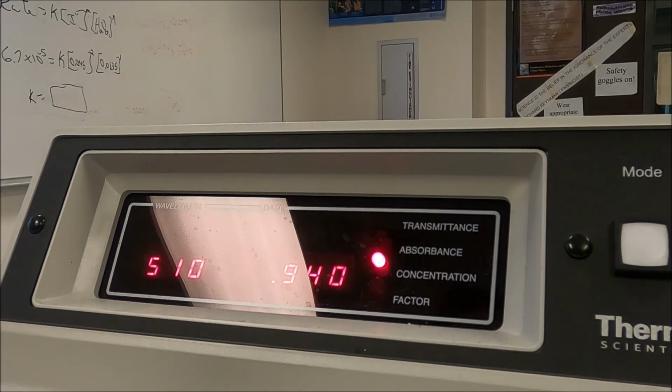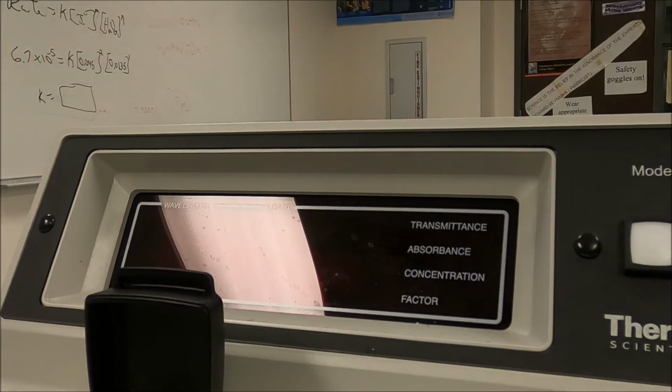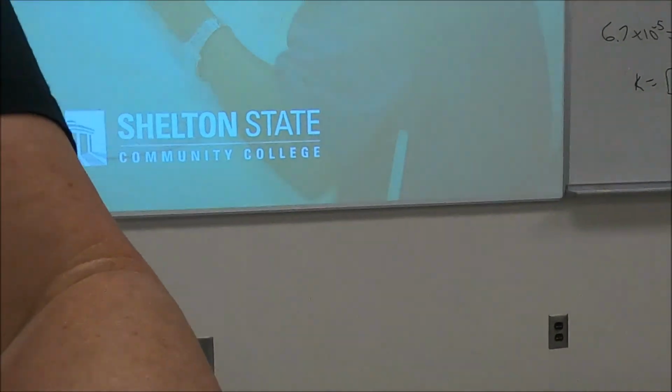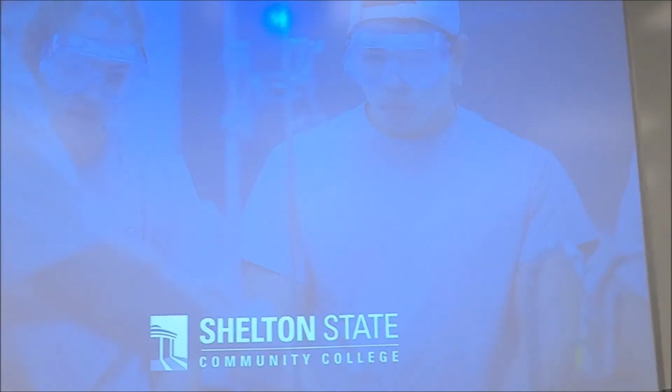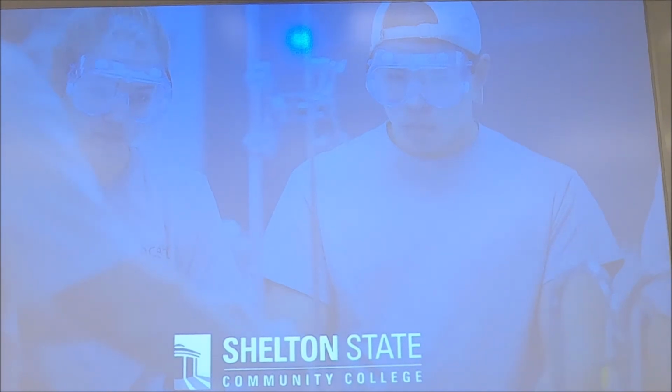Okay? So we have collected all of our data. We're done collecting data, and now it's just a matter of processing our data. So let's go back to looking at our screen here. I'm going to talk about processing data. I know the screen has gone all Shelton State on you, but don't panic.